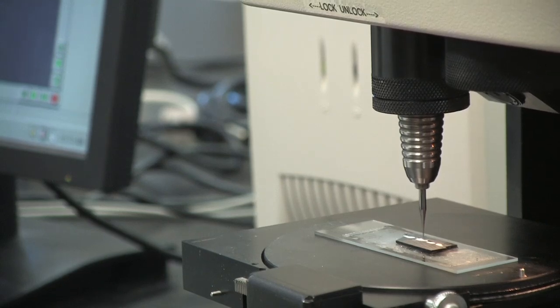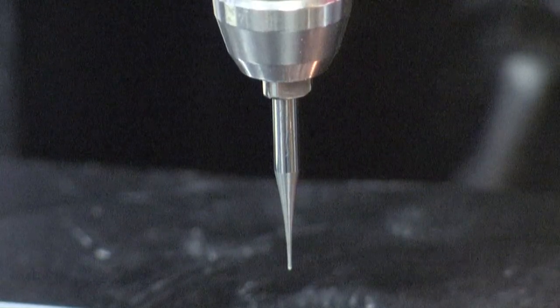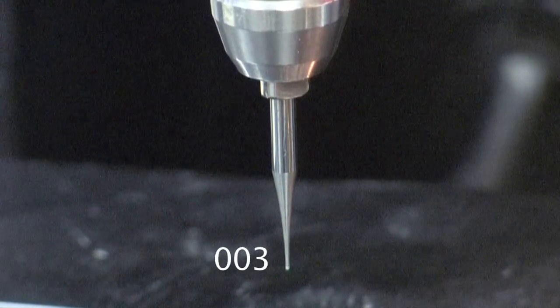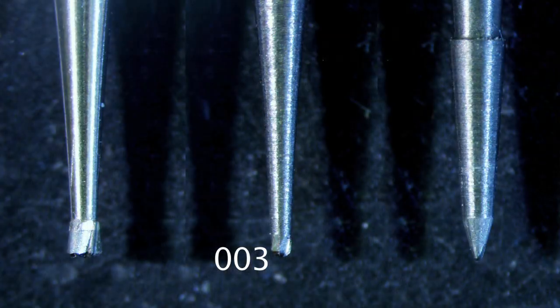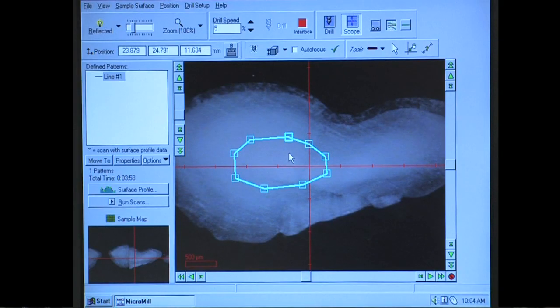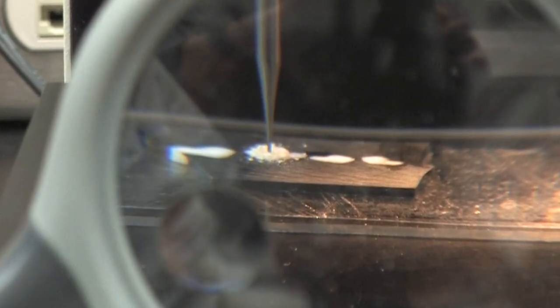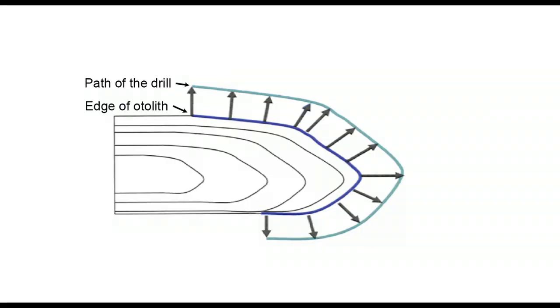You want to make sure the drill bit will not interfere with the annulus you want to collect, so be aware of the size and shape of the drill bit being used. The 003 round burr is best for most applications and is the bit that we use most often. Some bits are tapered, such as the 008 Scriber drill bit, and it will cut into your sample widthwise as it drills deeper. Since the drill bit drills in the middle of the sample line you draw, it will drill into part of your sample and destroy valuable material. Generally samples are small and you will want to obtain as much material as possible from them for your analysis. Offsetting the drill path by the radius of the drill bit will help you maximize your sample size.